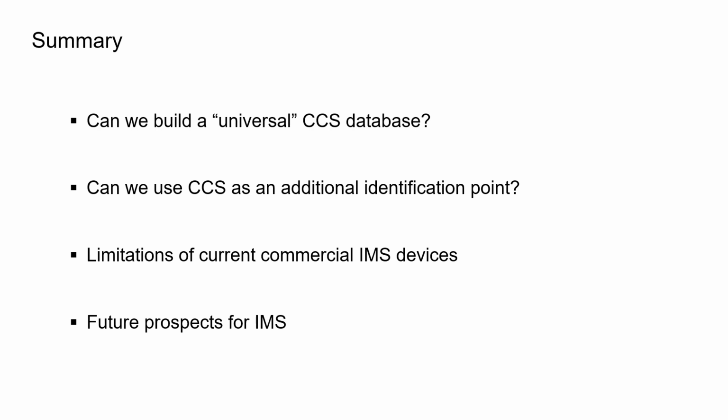As usual, I start with a short list of topics that I will treat. I will first try to answer the question, can we build a universal CCS database that can be applied regardless of the technology type? And also, can we implement the CCS as an additional parameter in the identification criteria for regulatory methods?